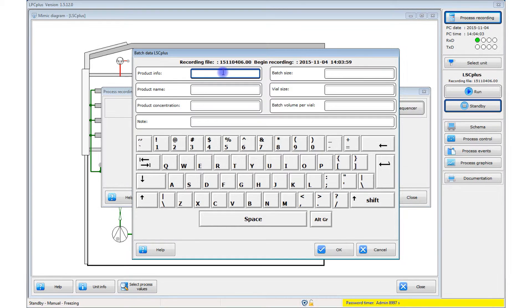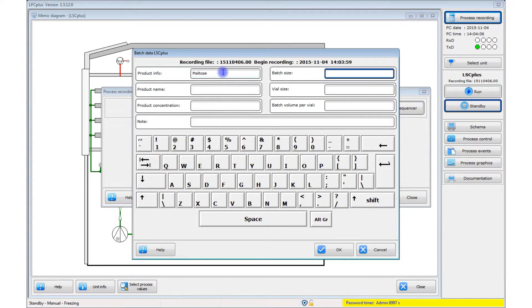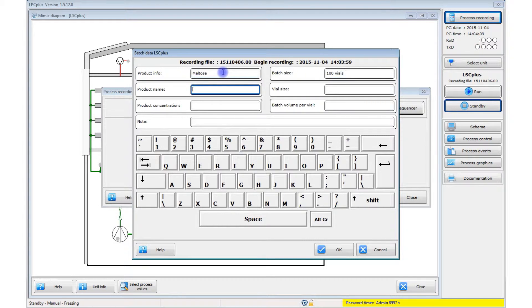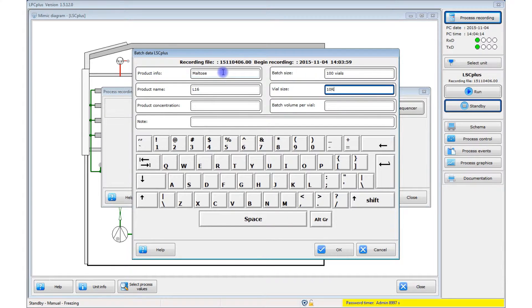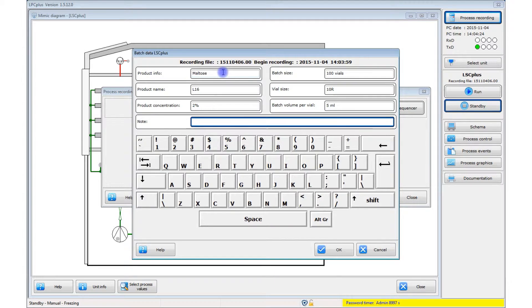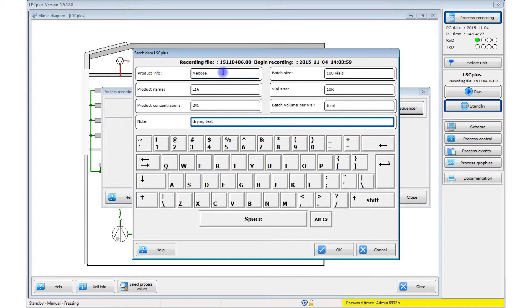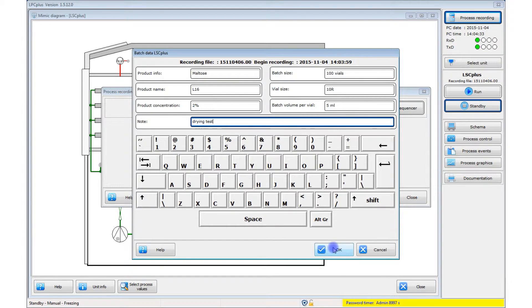All data related to the process, such as the batch number, number of vials, product concentration and so on, is shown in this window. This data is used to identify the process in the process documentation and for comparison with other processes. You should not start the freeze drying process without entering the data here. Confirm this window with OK.